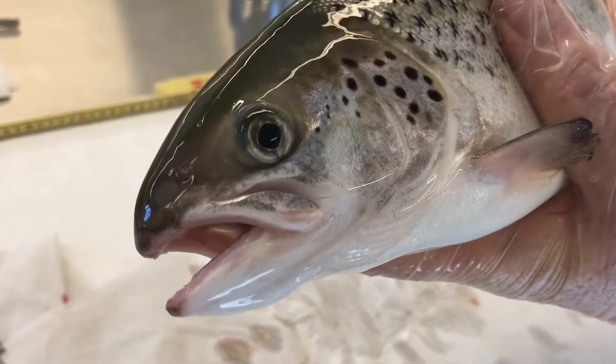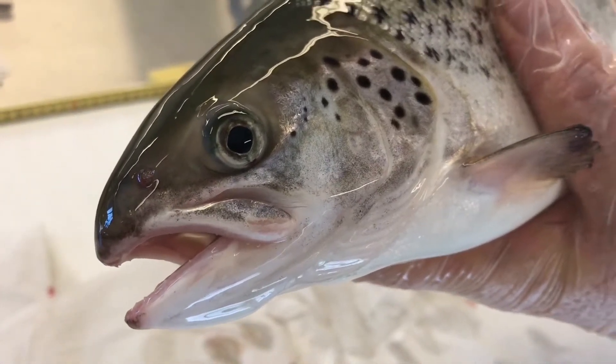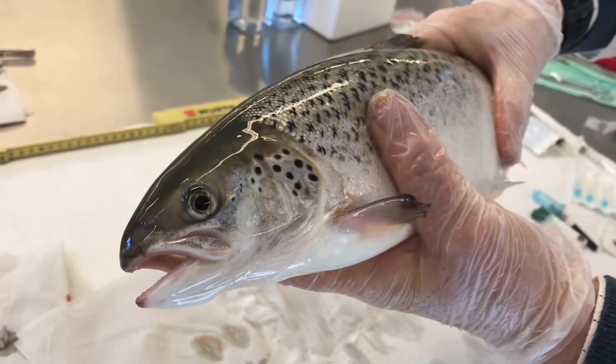Evan and me Adam. Today we are going to demonstrate how to take samples from anesthetized fish.